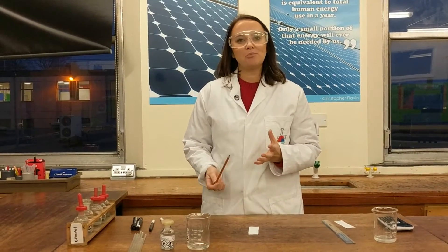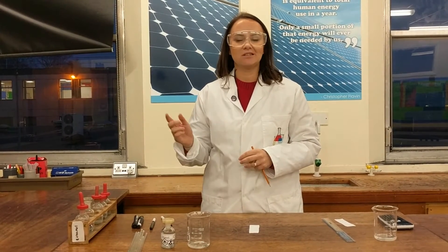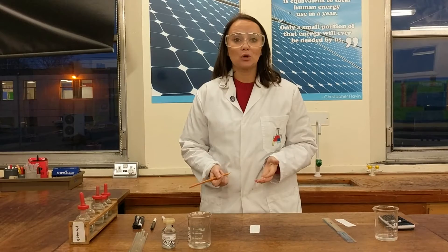Today we're going to look at investigating the composition of inks. There's two parts of this practical that you need to know about. The second part is distillation, which is in another video. Today we're going to look at chromatography.